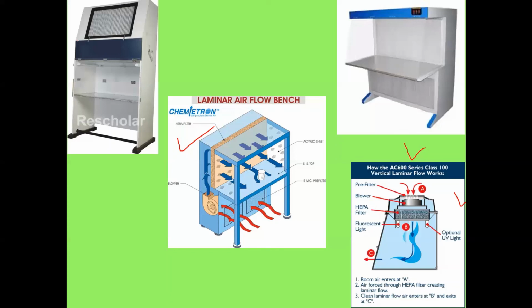You have the HEPA filter, the ventilator, and you have the pressure. That's it. And this is the glass shield. Always try to buy or prefer the covered one, because you protect them. Once you complete your work, you close them and you keep them clean.